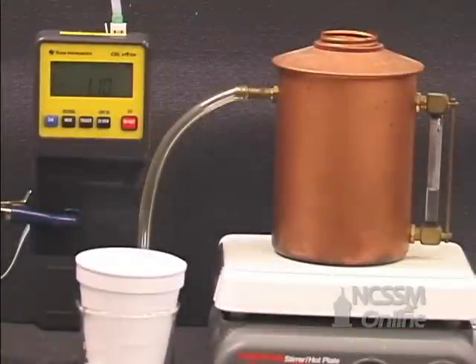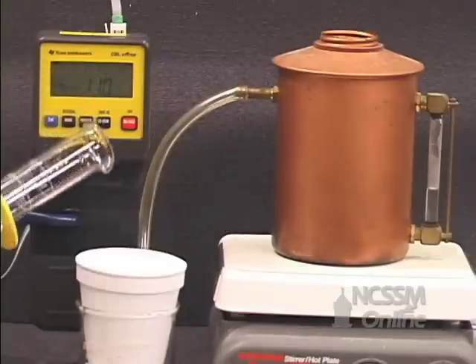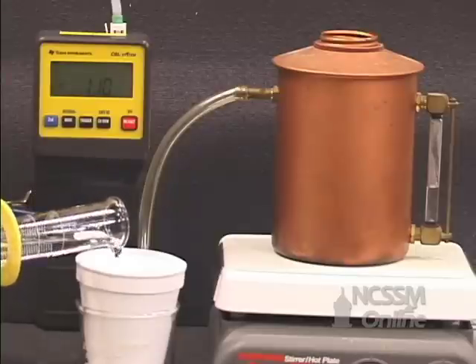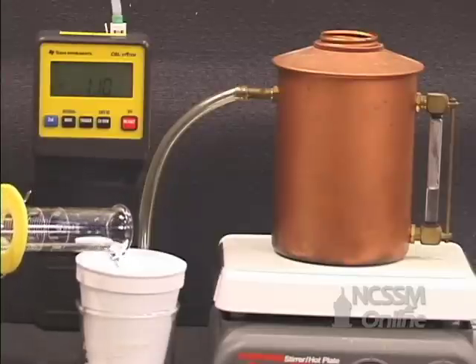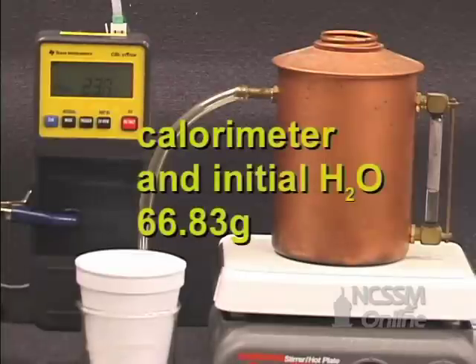We're going to do an experiment to determine the molar heat of vaporization of water. We're going to mass an empty calorimeter, add about 70 milliliters of water to the calorimeter, and then remass the calorimeter and the water.